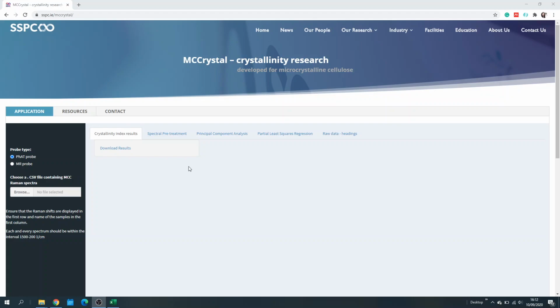The focus of this video will be on how to use this application, but detailed information about all these models is available in the manuscript in the Resources tab. To get started, we need to organize our data in a format that MCCrystal understands. This is the most critical part of the usage of this application. There are 5 requisites that must be met.